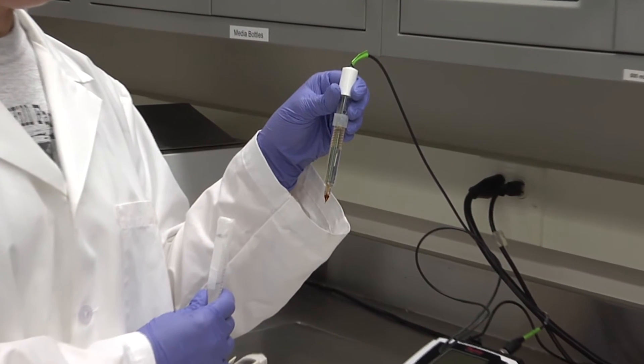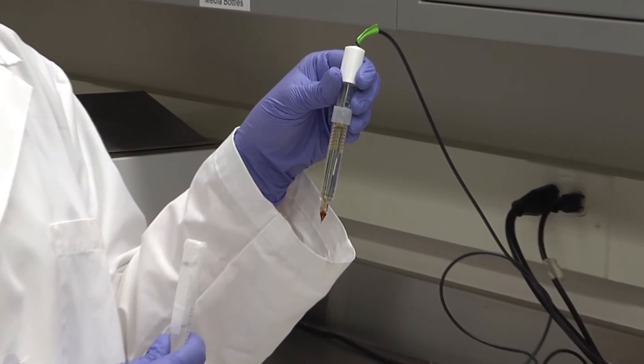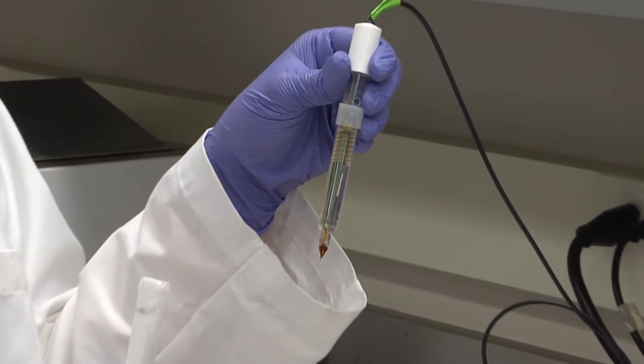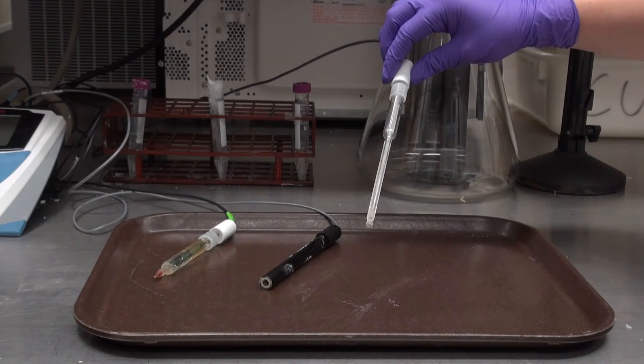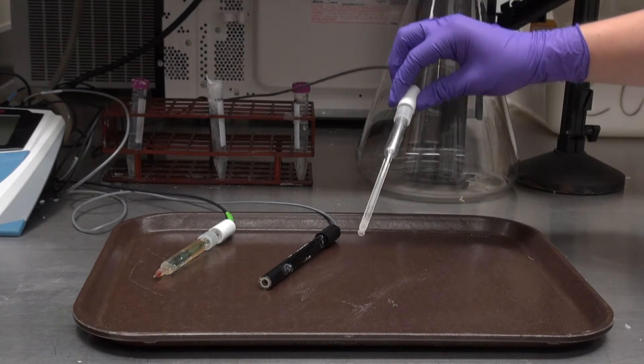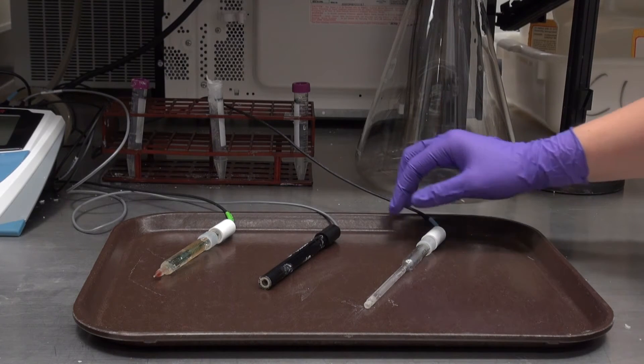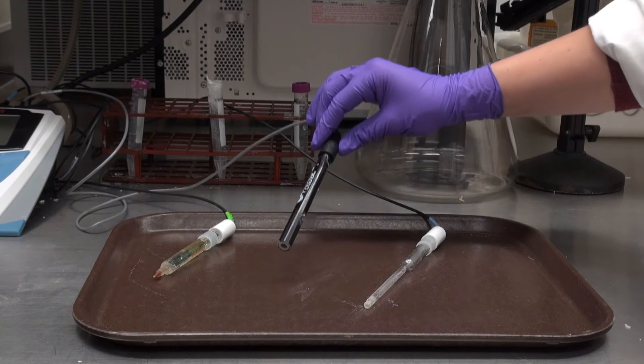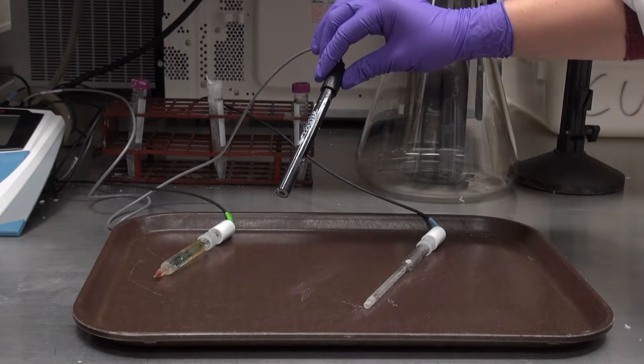The electrode is the portion of the meter that is actually inserted into the meat sample or solution being measured. Some electrodes are specific to measuring only liquids, some measure surfaces of products, and some are able to be used on a variety of sample types.